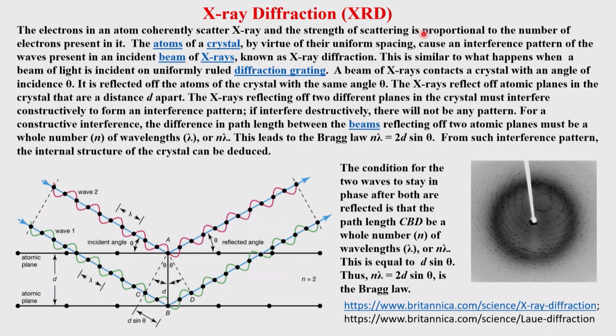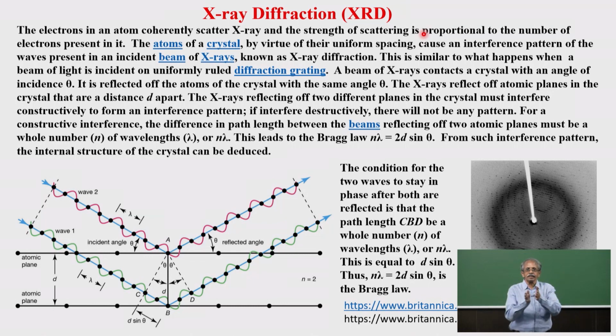We know very well that diffraction is nothing but when you have some object in the passage of the light, the light bends and goes. So, this is the bending process. If you wanted to see it a little more closely, I am sure every one of us knows what a grating is. A grating has very fine lines which you cannot see with the eye, because the lines are separated by a few microns. Now, if you make light incident on this, obviously what you get is diffraction, which means the light gets scattered in different wavelengths and separates out, and then you would look at that.